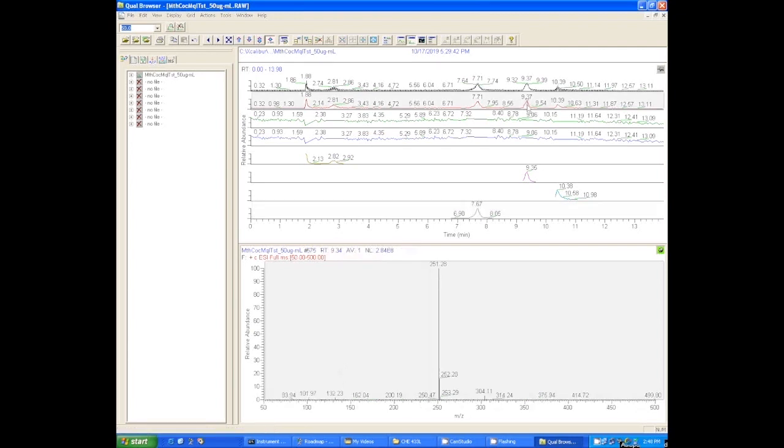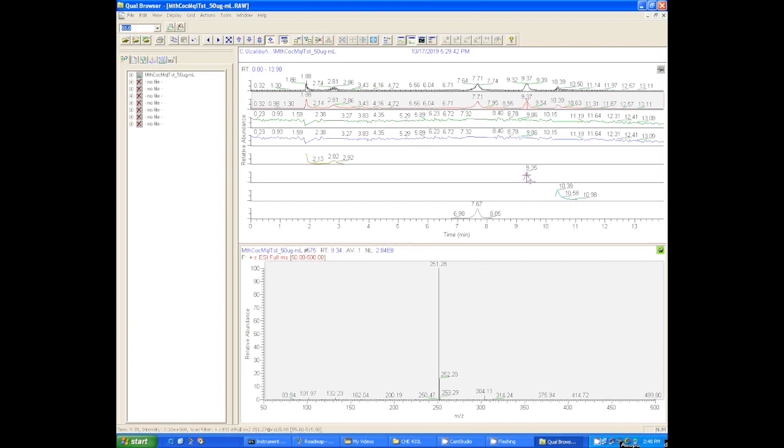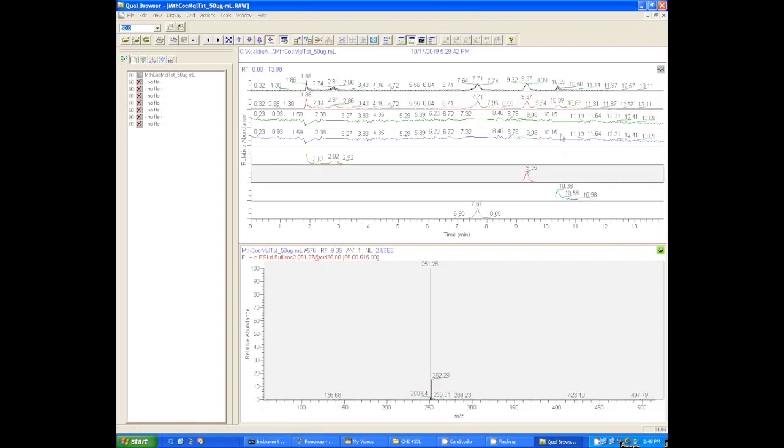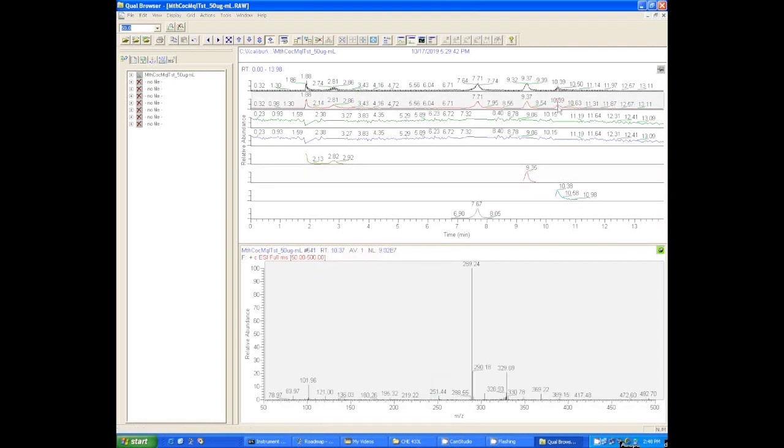We'll look at the next peak over, that methaqualone peak. If you go to that second one down, the MS1, and click on it, you get the 251. Now when we go to the MS/MS here, we can see that we did do the MS/MS spectrum, but we still got 251. So we probably didn't put enough collision energy in there and we would probably need to run this again.